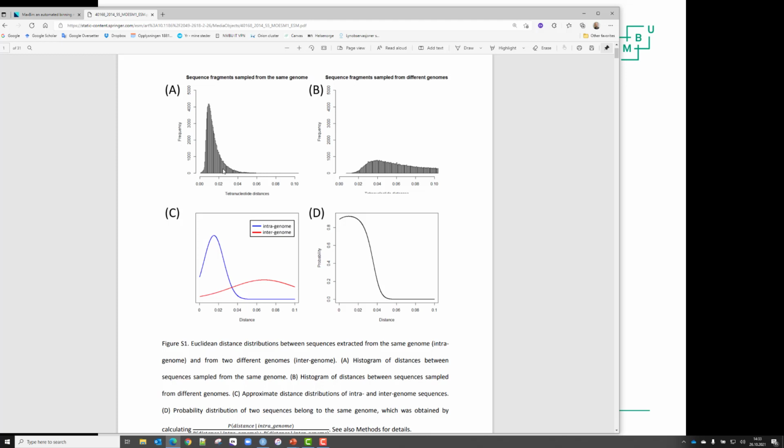We can just take a genome sequence and cut it into pieces, fairly long pieces though, as if they were contigs. And then they counted these 4-mer frequencies, right? Just like we saw now for each contig.